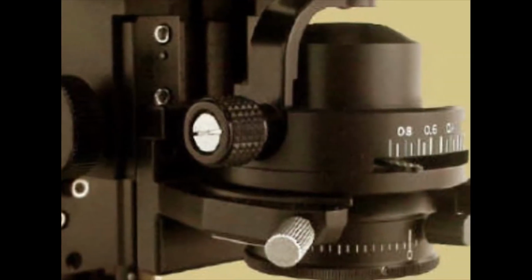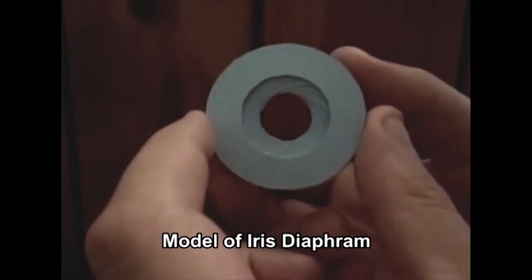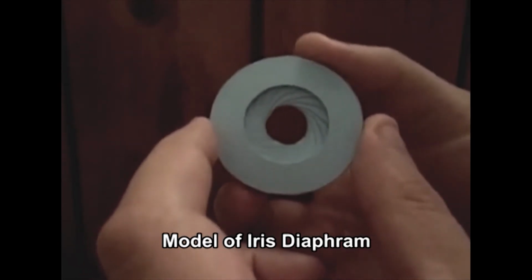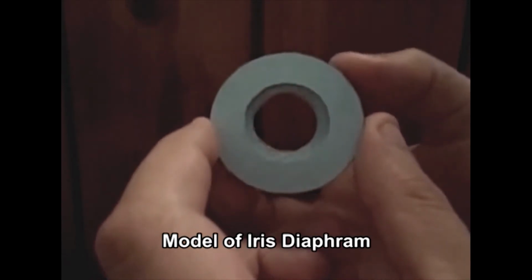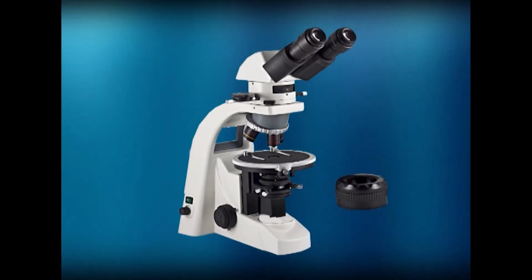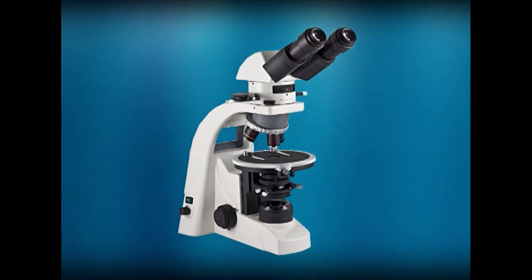Iris diaphragm: it consists of a number of overlapping leaves or membranes attached by pins to the rim of a casing and having a central opening which is enlarged or diminished by moving a lever, and is placed above or below the polarizer. The polarizer is a Nicol prism mounted in a circular metal case forming the bottom unit of the substage assembly, and is also called the lower Nicol.